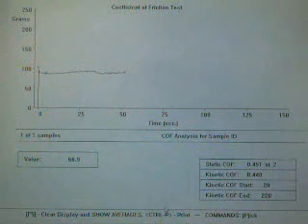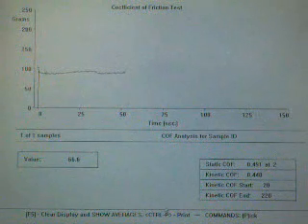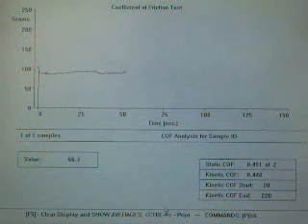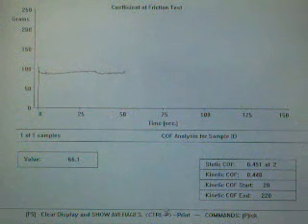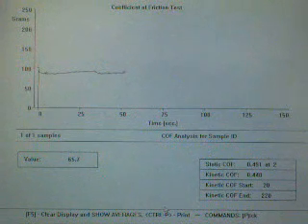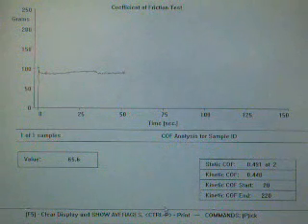After recording the test data, determine and report the calculated static and kinetic coefficients of friction together with the standard deviation. Static COF is calculated as follows. Static COF equals initial or maximum motion scale reading divided by sled weight. Kinetic COF equals average scale reading obtained during the uniform sliding of the film surfaces divided by the sled weight. COF is a unitless number or coefficient. The force and weight values stated in SI units are regarded as the standard.